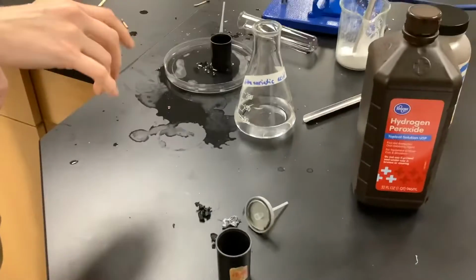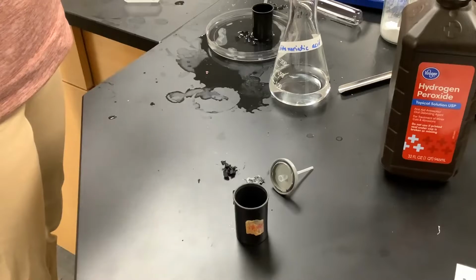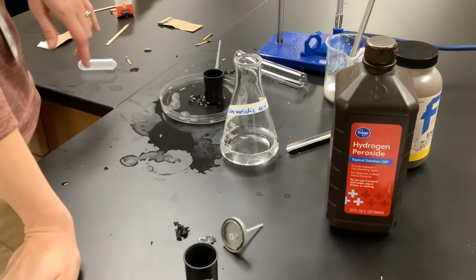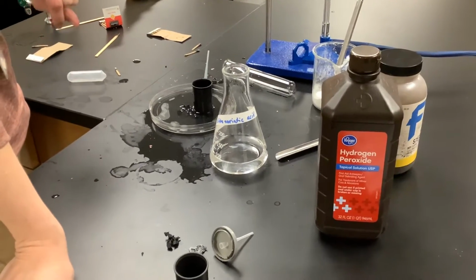Good? All right, so here's what we're doing. We are talking about chemical reactions. Chemical reactions have reactants that are distinct from the products. So whatever products we produce are different from the reactants that we started with. Often, chemical reactions produce a gas as one of the products.